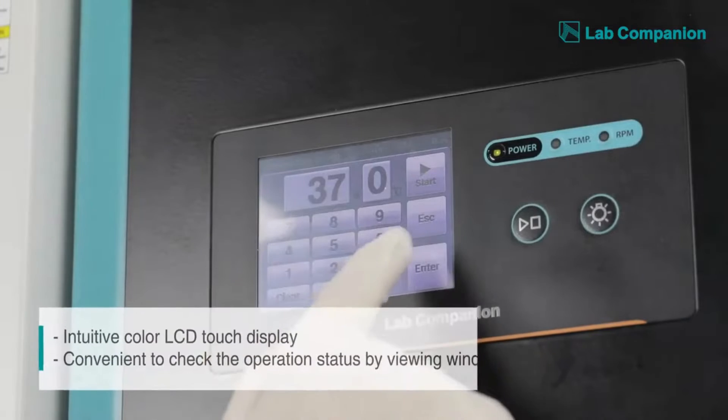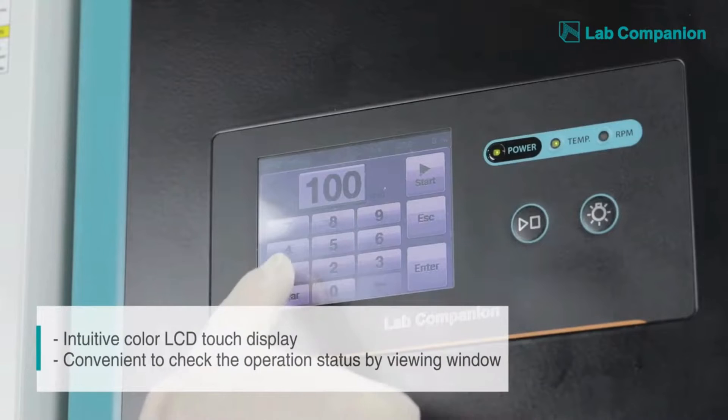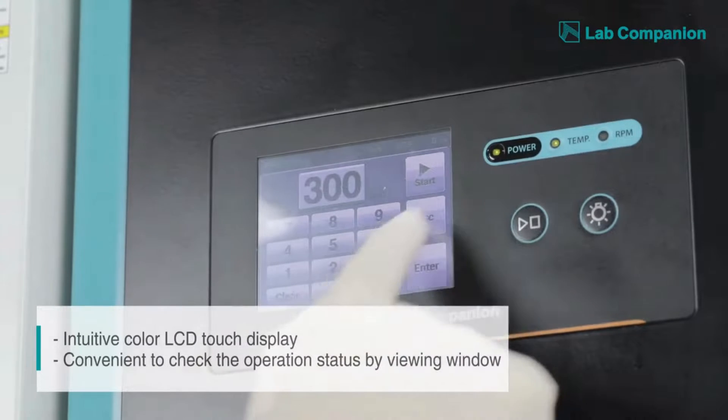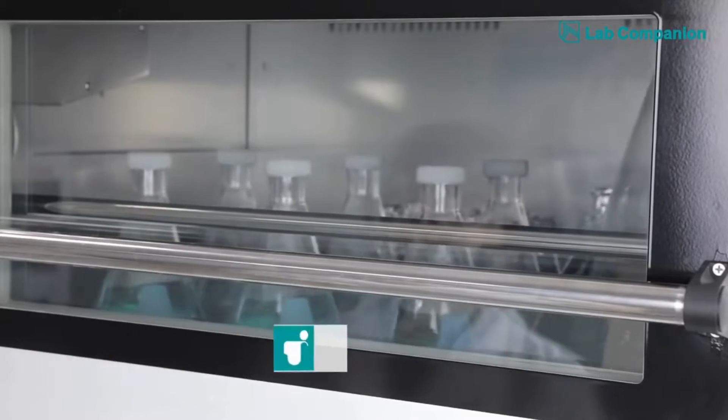Once all samples are loaded, the user can conveniently enter the device configuration using the touch screen color LCD control panel, and easily monitor the ongoing operation status through a large inspection window.